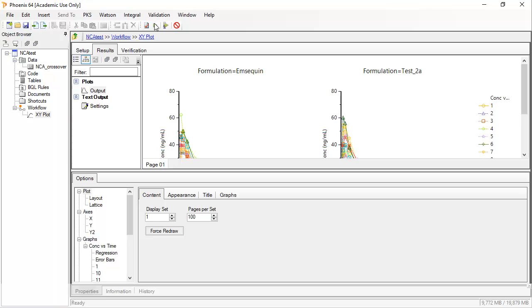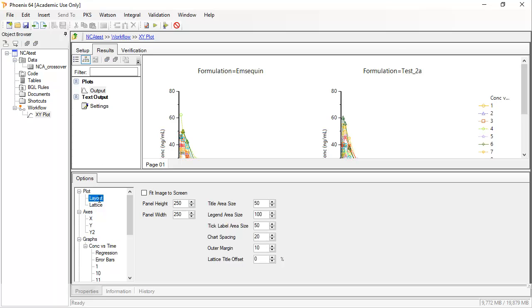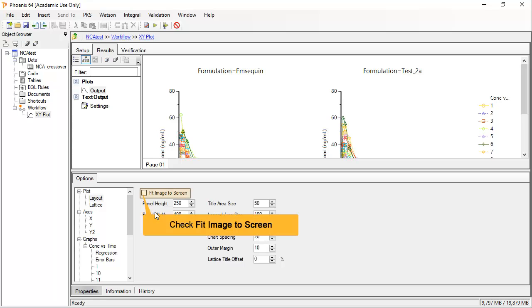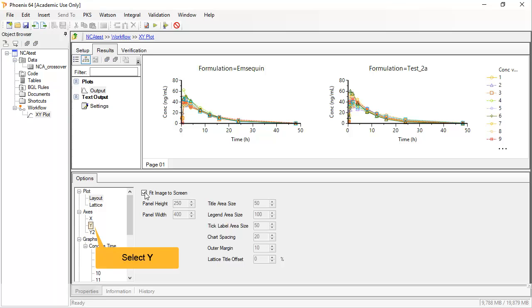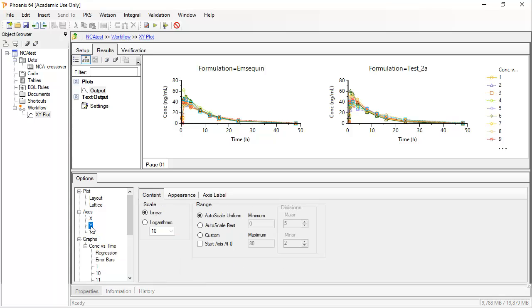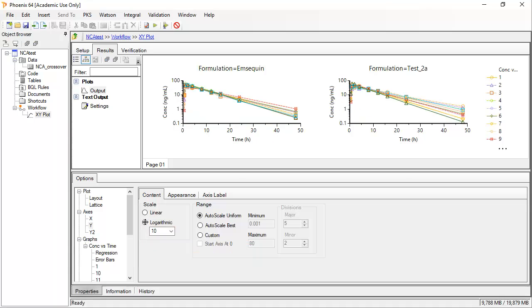The plot is generated and displayed in the Results tab. To better visualize this plot, one can select Layout and, for example, alter the dimensions of the plot, then click Fit Image to Screen. The two formulations are presented side by side because Formulation was selected as a column lattice. The plot can be formatted in different ways, like changing the Y axis to Log. Note that the upper panel can be made larger by simply dragging the border down.